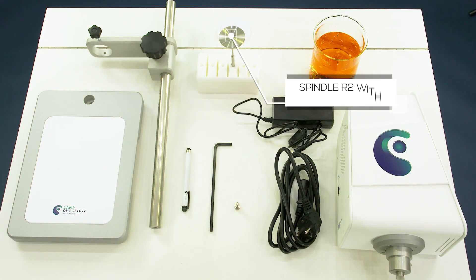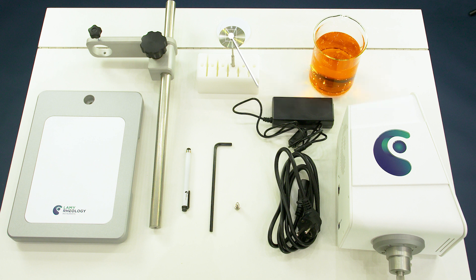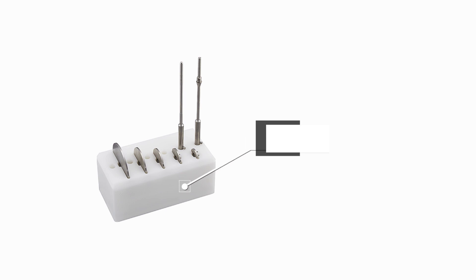Unpack all accessories from the box according to your configuration. A complete set of ASTM R2 to R7 spindles can be delivered with the device.